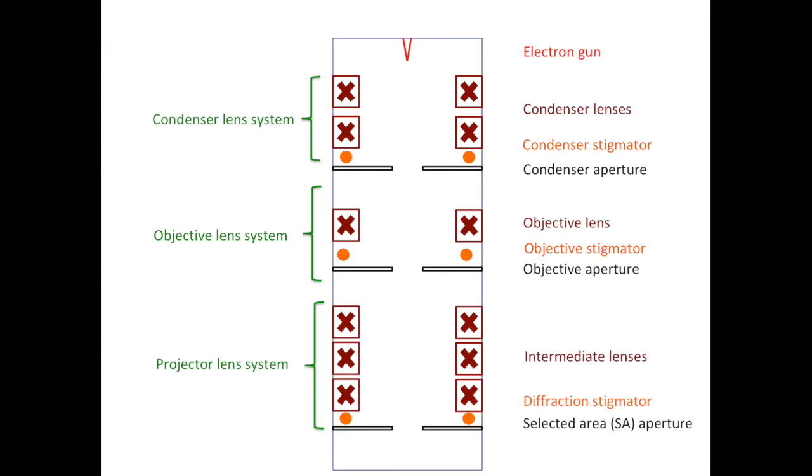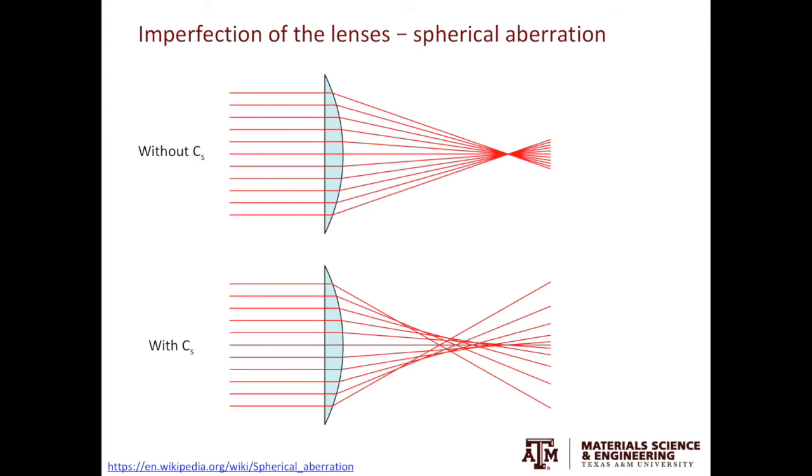The second type of the lens imperfection is the spherical aberration. In the ideal lens system, all the parallel rays should converge to just one focal point. However, for a lens with the spherical aberration, the focal point depends on how far the ray is from the center axis or the optical axis of the lens. With spherical aberration, there is no single focal point which leads to the smearing of the image.